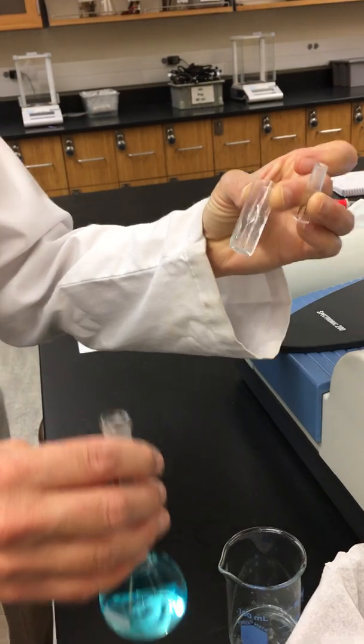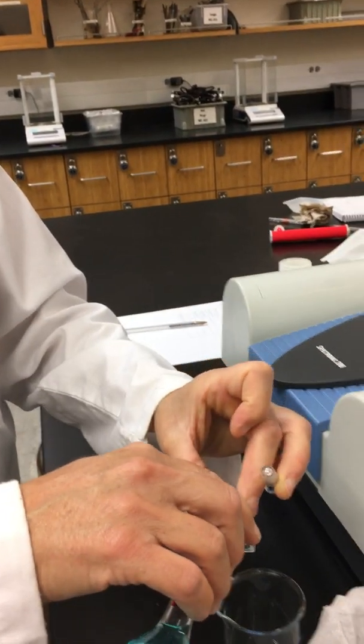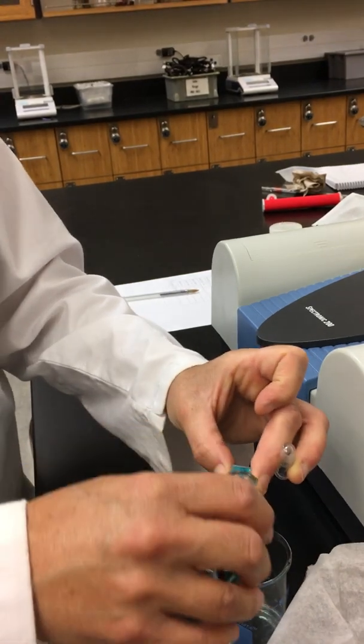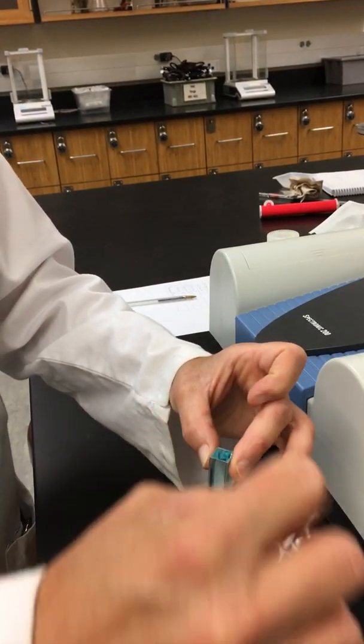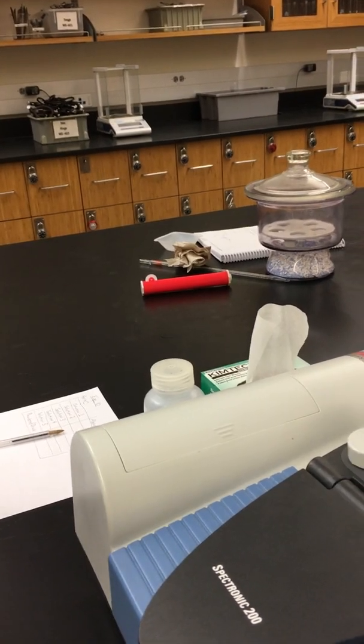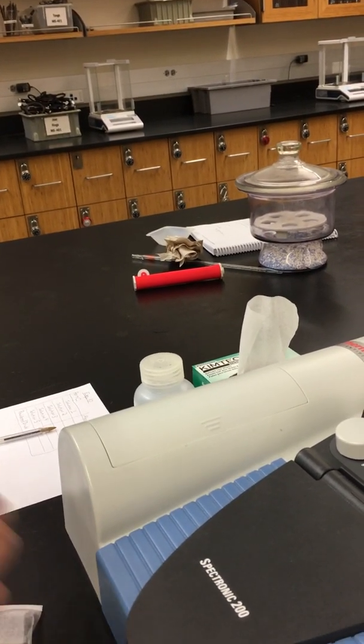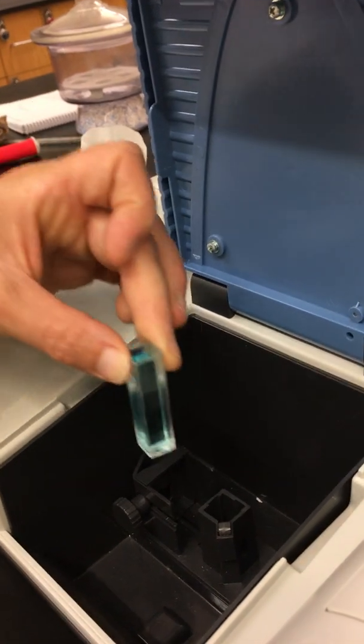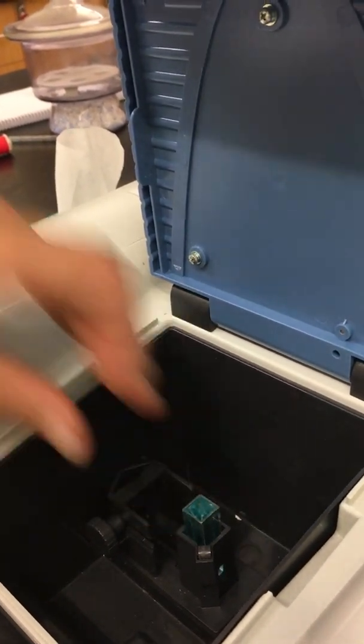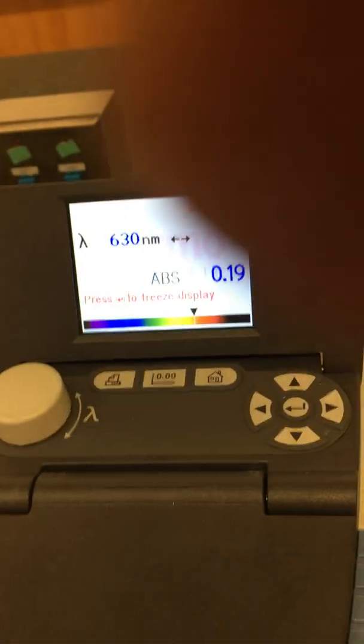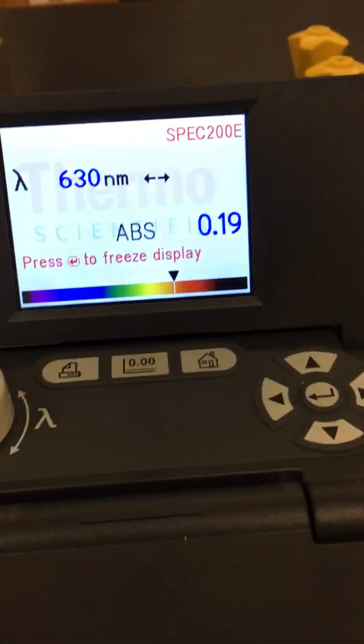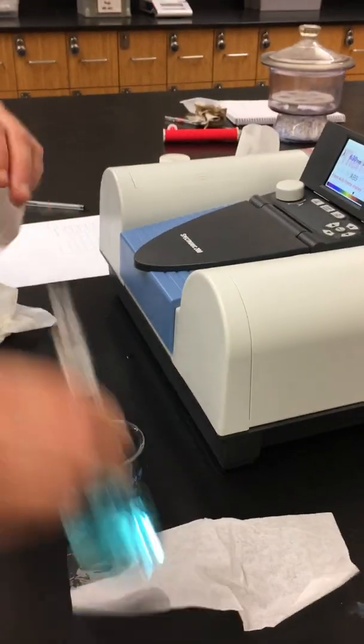We'll add some solution. We'll rinse out our cuvette. So now the only thing that's in there is just my solution, so that way we'll get an accurate absorbance of my first solution. We have our cuvette, our Kimwipe, so we can wipe off any liquid that got on the surface. We'll place it inside our instrument. Close our lid and it will measure our absorbance. Our first absorbance is 0.19 for solution number one. Now we're ready to measure our next solution.